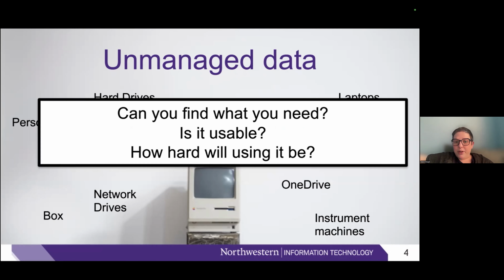So that begs the question: if you actually need to go back to your data later, if you put your project down for a few months, like let's say you submit a paper and have to go back to revise a figure, can you find what you need? Are you going to be able to use it? And I'd say for the most part, people can get over those hurdles and make it so that you can use your old data, even if you haven't really put a lot of time into managing it. But it's going to be really hard. You're going to spend hours of wasted time that you could have saved yourself if you would have thought about this stuff up front.